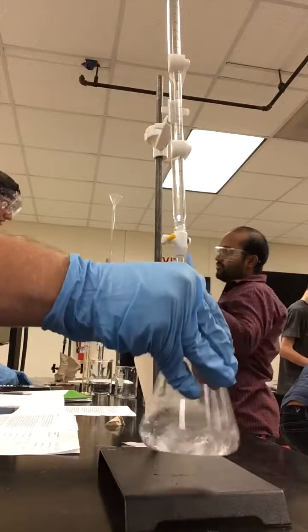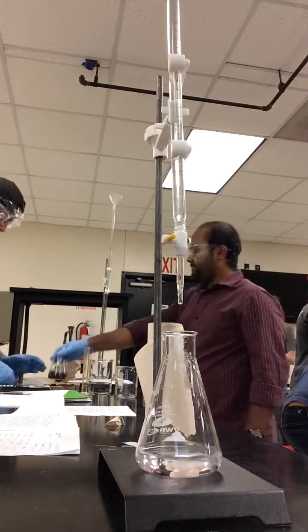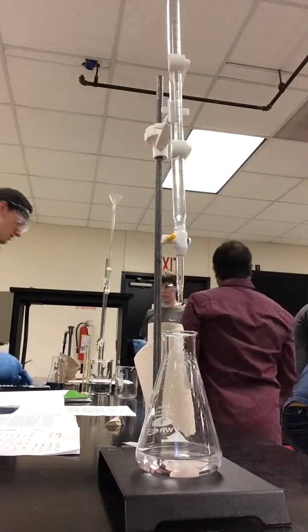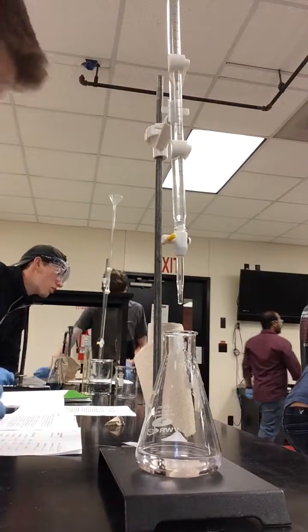So you have to titrate right. You know the color, what it should be. Okay, so next time you have to do that. Okay. That would be all right. 16.2.